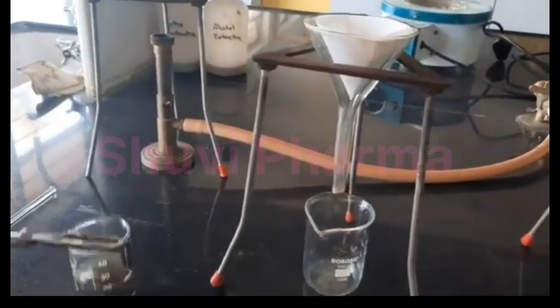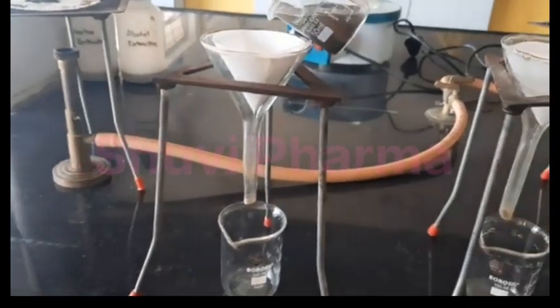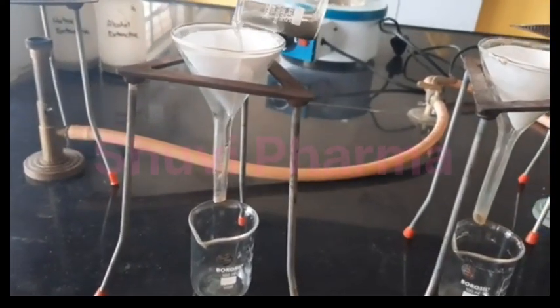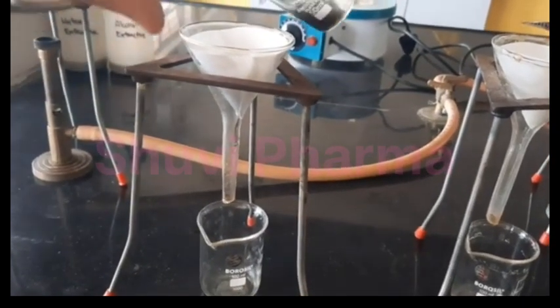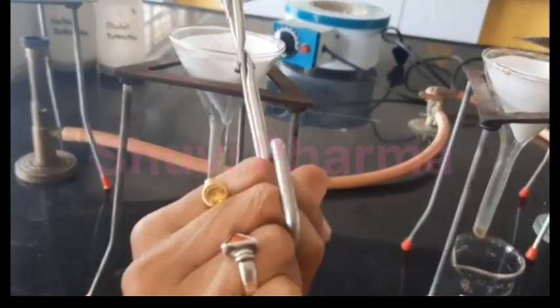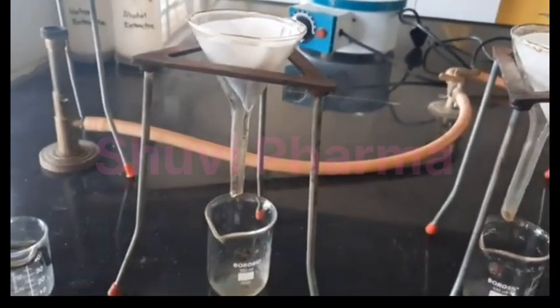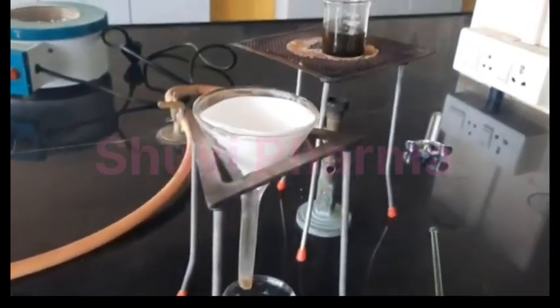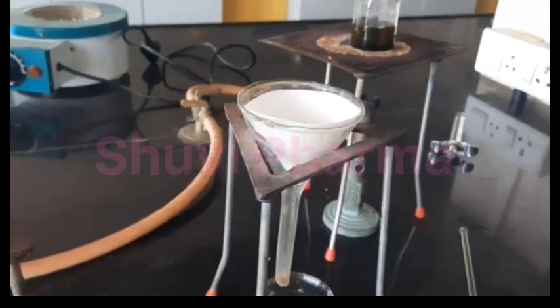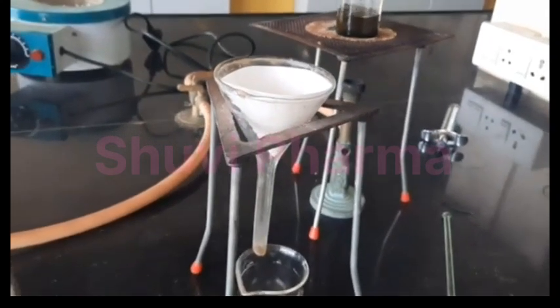Okay, that is Whatman filter paper. So this is for water soluble. And this is acid insoluble.